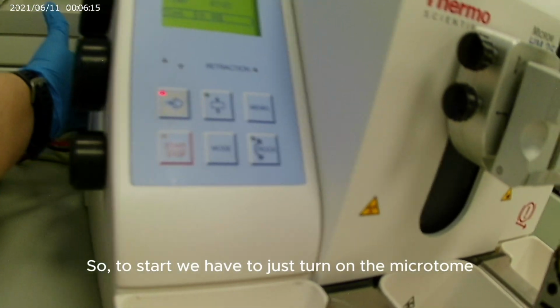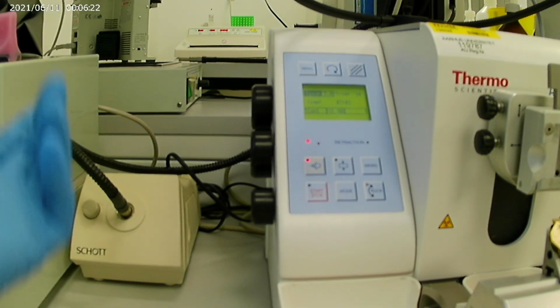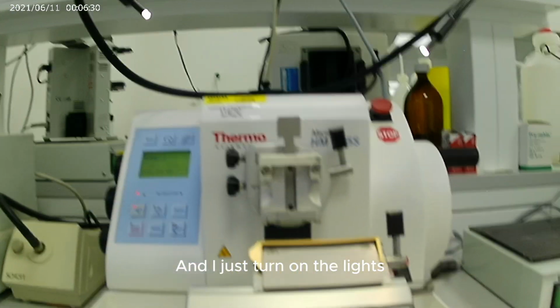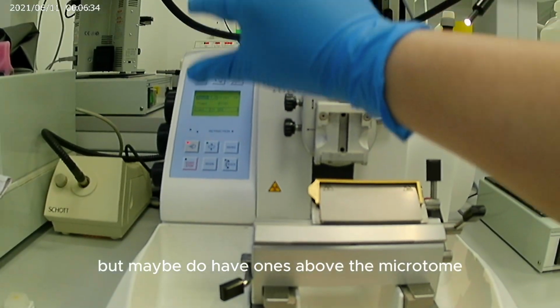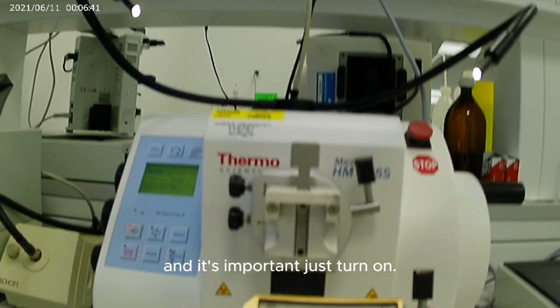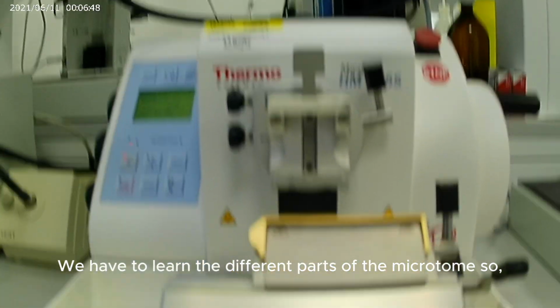So to start, we have to just turn on the microtome with a button that is on the back of the microtome. And I just turn on the lights. Maybe you don't have these lights, but maybe you have ones above the microtome, and it's important, just turn them on. We have to learn the different parts of the microtome.